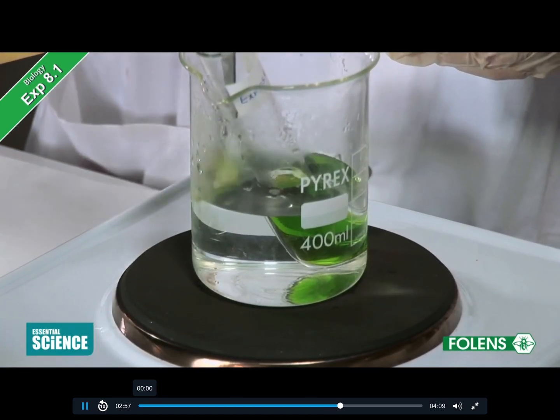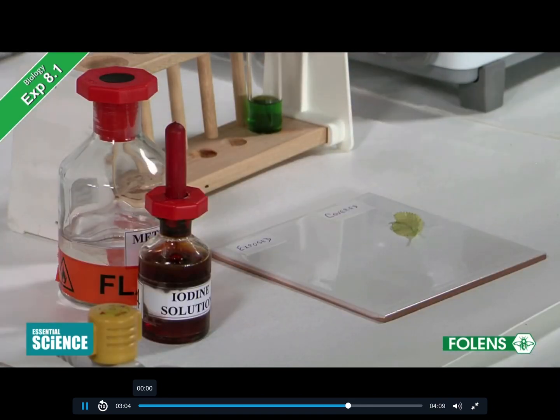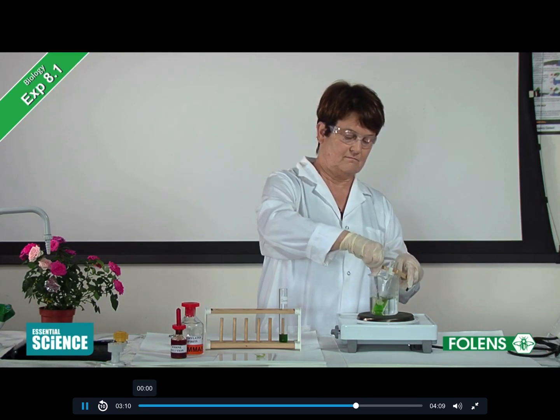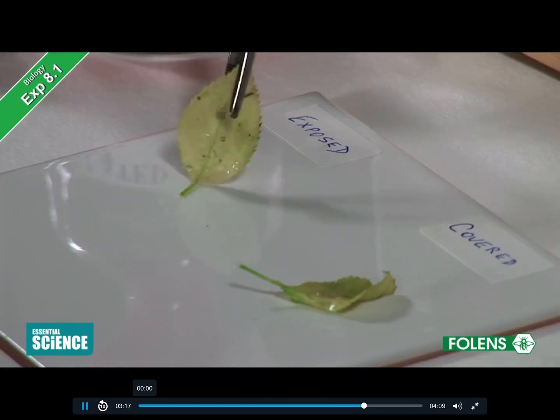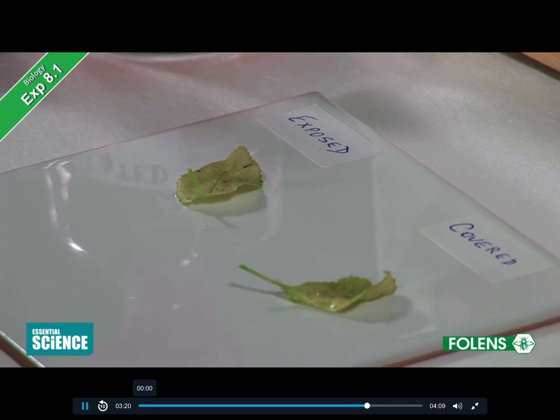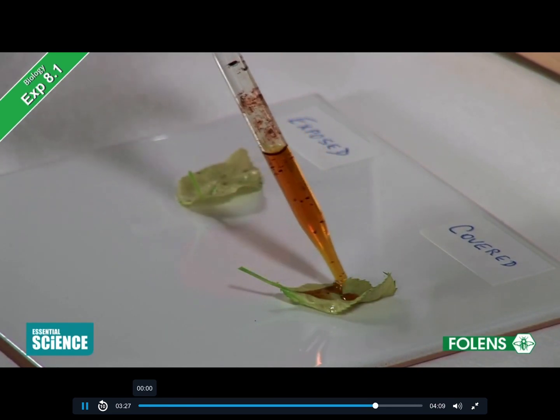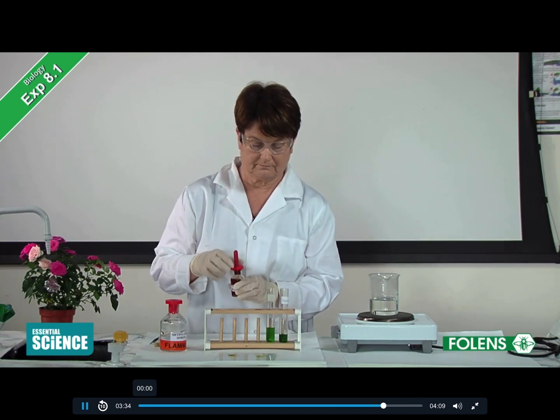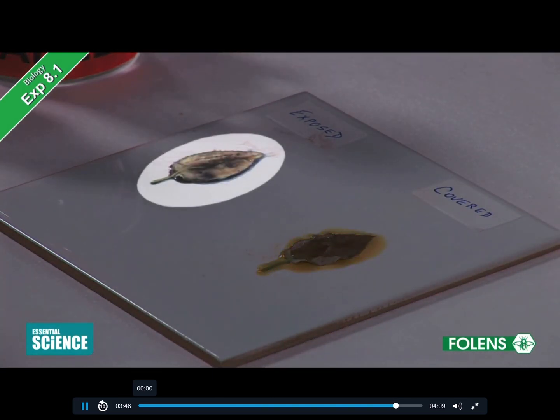This is done to remove the alcohol and to soften the leaves which have become brittle. The leaves are placed on a white tile. If the iodine stays the orange-brown colour, there is no starch in the leaf. If the iodine turns blue-black, it means there is starch present.